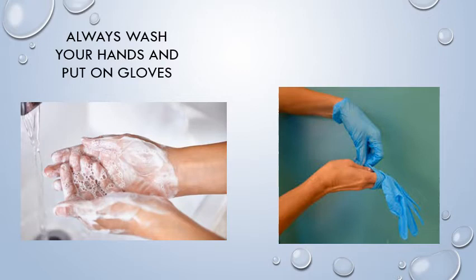Take a paper towel, dry your hands. Take another paper towel, shut off the water, open the door, shut off the light using the paper towel. Deposit the paper towel in the trash as you exit. You have not contaminated your hands. Apply your gloves to your clean hands.